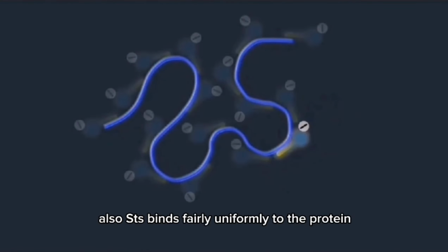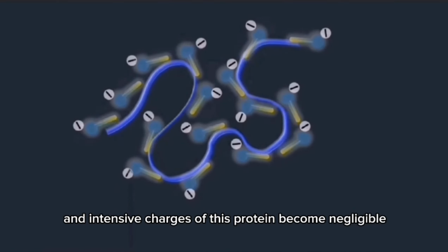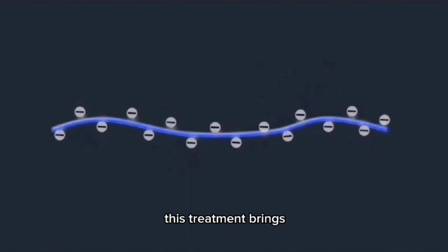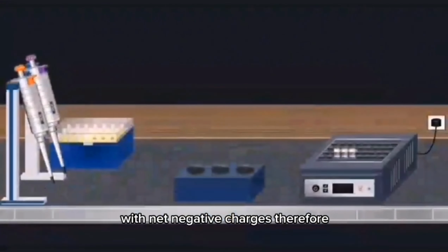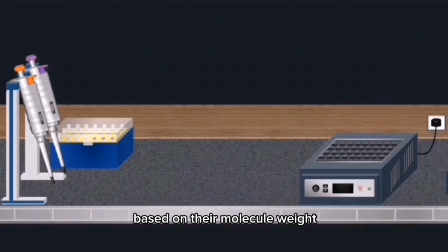Also, SDS binds fairly uniformly to the protein, and the intrinsic charges of the protein become negligible when compared to the negative charges contributed by SDS. This treatment brings the folded proteins down to a linear molecule with net negative charge. Therefore, these proteins can be separated in a polyacrylamide gel based on their molecular weight.